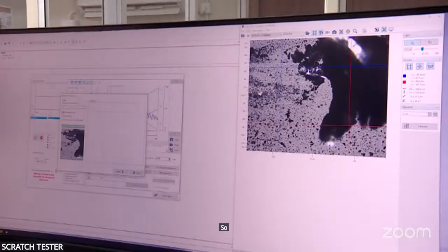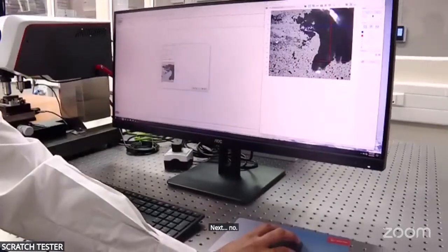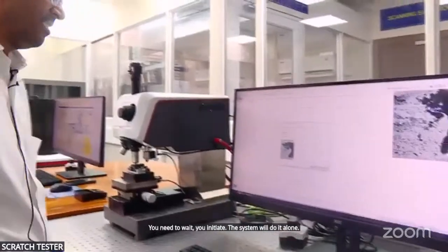So it's done. Let's click next. No, you need to wait. Yeah, the system will do it alone. Stitching. Yes.